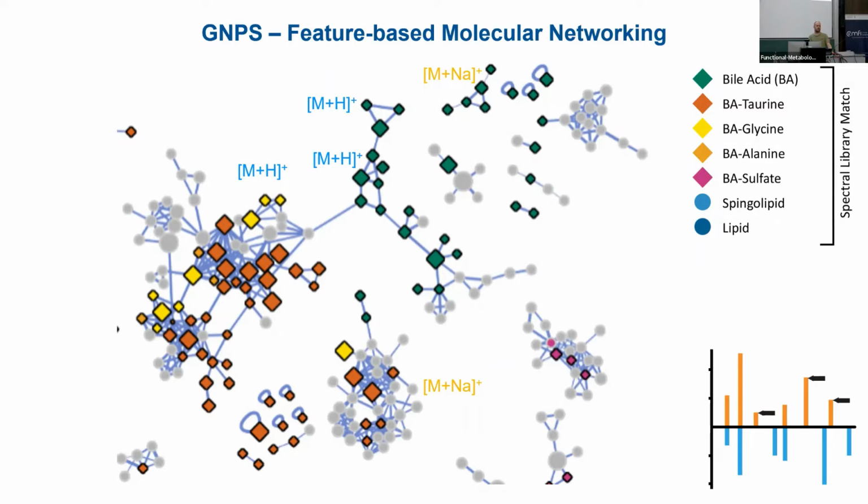Right. So this might be a complete misunderstanding from my side, because I have a hard time wrapping my head around this. This is based on the fragmentation data, no? Yeah. You said it's just based on the MZ. In normal metabolism, a lot of what happens in fragmentation also happens in normal metabolism. Can that interact? You think it's fragmentation, but it's actually just a metabolite that a metabolic step has taken.